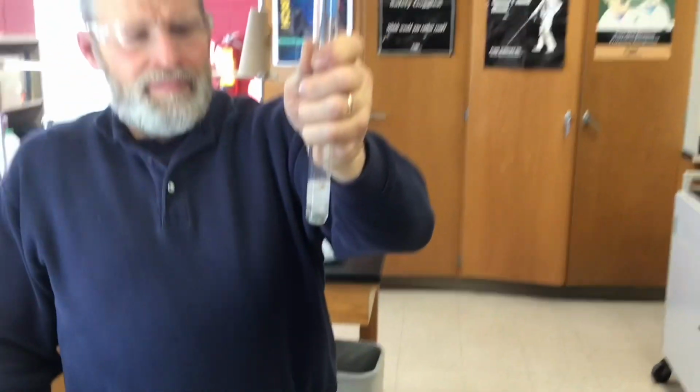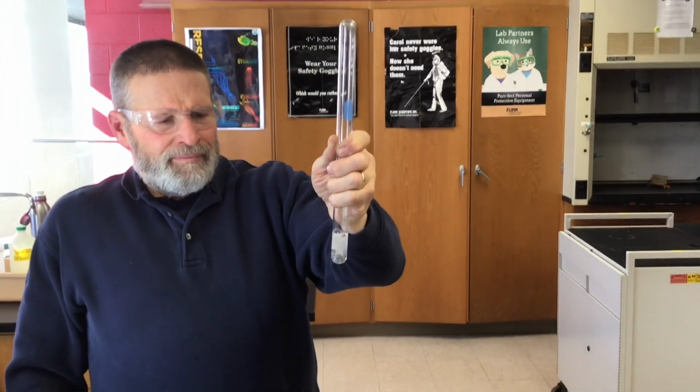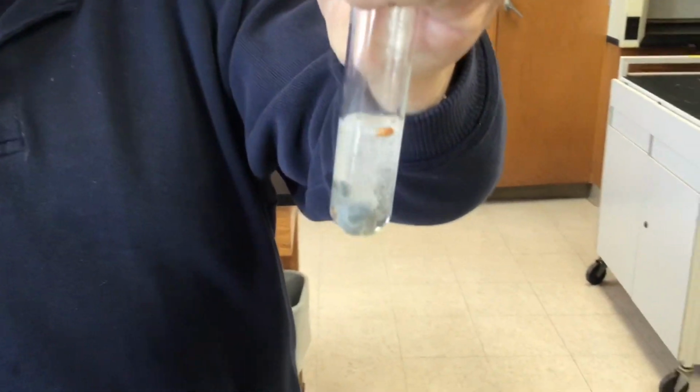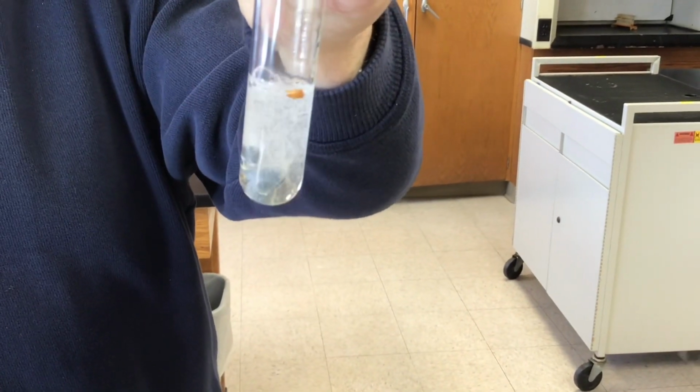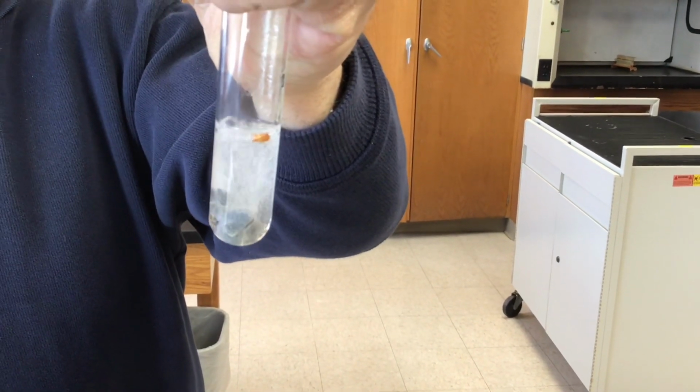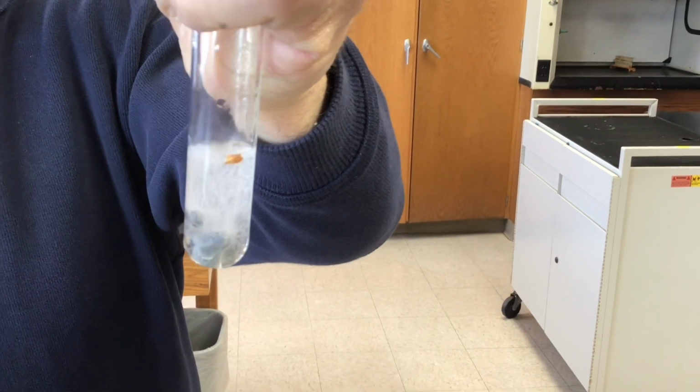So now we're collecting the gas again. Got the upside down tube. It was just taking too long. We had a lot of really tiny bubbles. Yeah, we could definitely see the difference here. It's bubbling very well now.